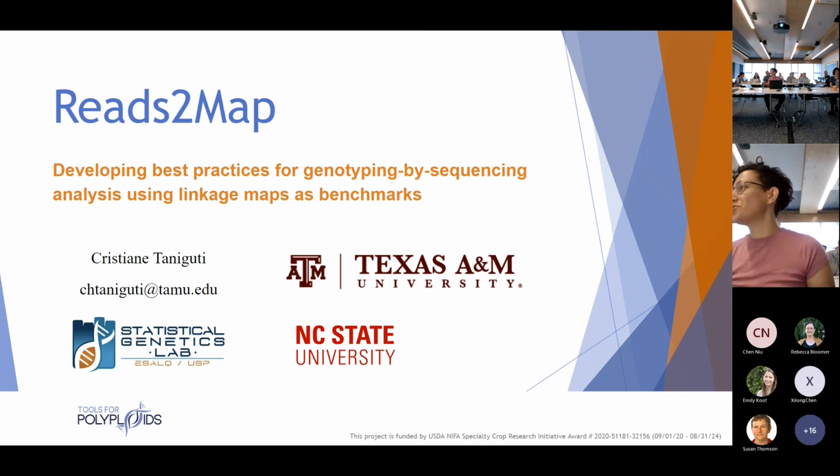Perfect. So thank you so much, Susan, for making available the server. It will be the first time that I will be running Reads2Map, so I'm very excited, but a little bit scared too. I hope everything goes fine. And I will do just a presentation to understand where it's coming from, why we created this. It's a collection of workflows made for making everybody's life easier, just for doing SNP calling and genotype calling. And I started this work when I was in my PhD.